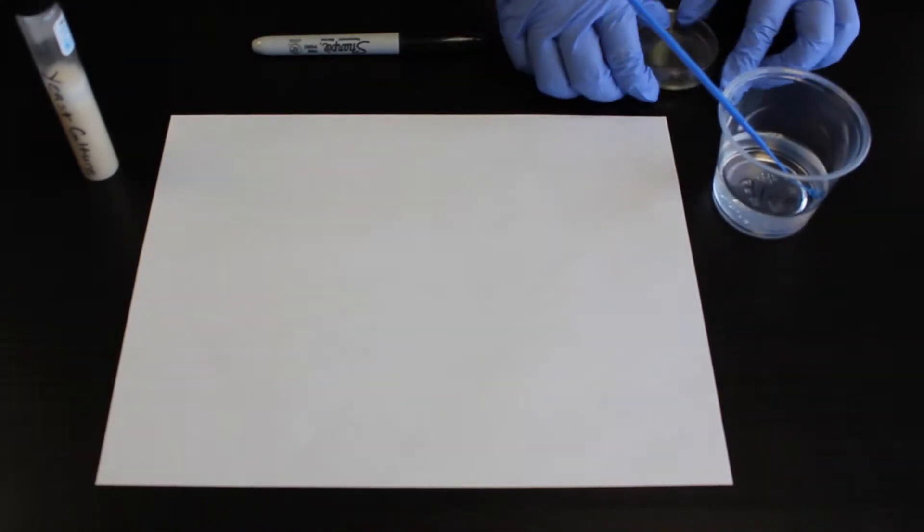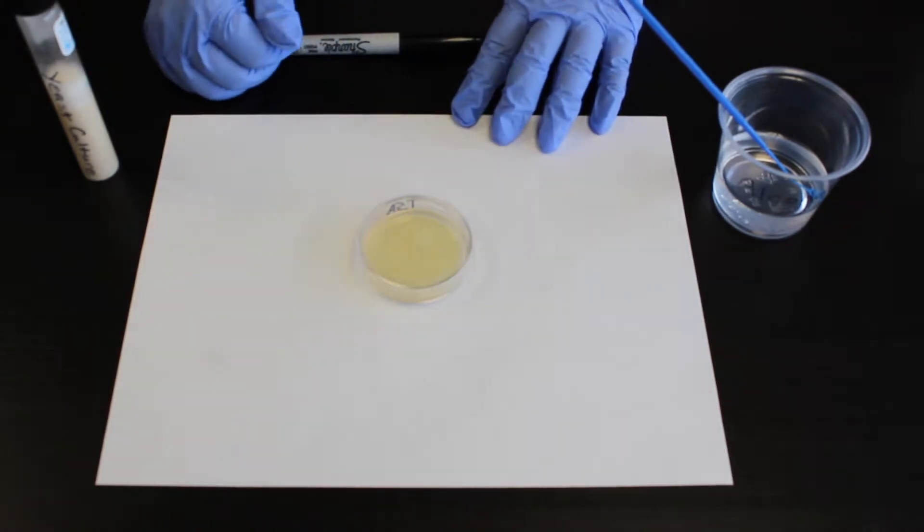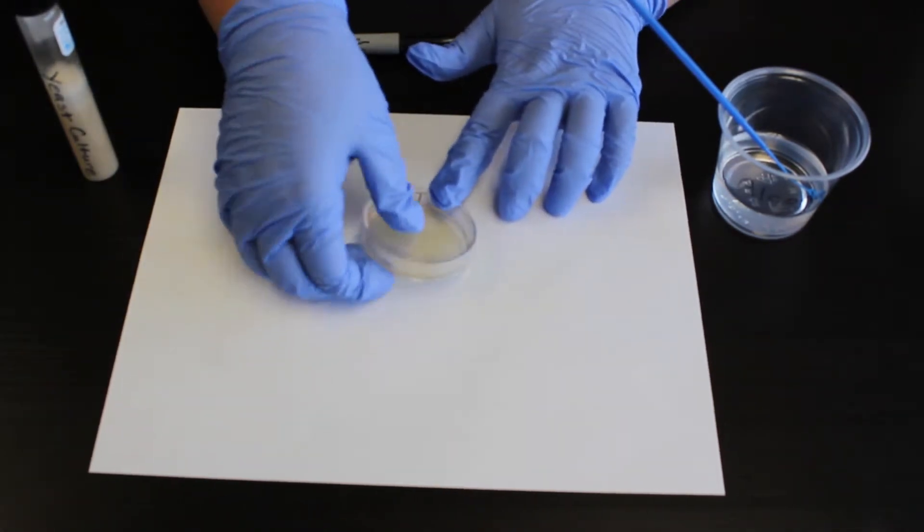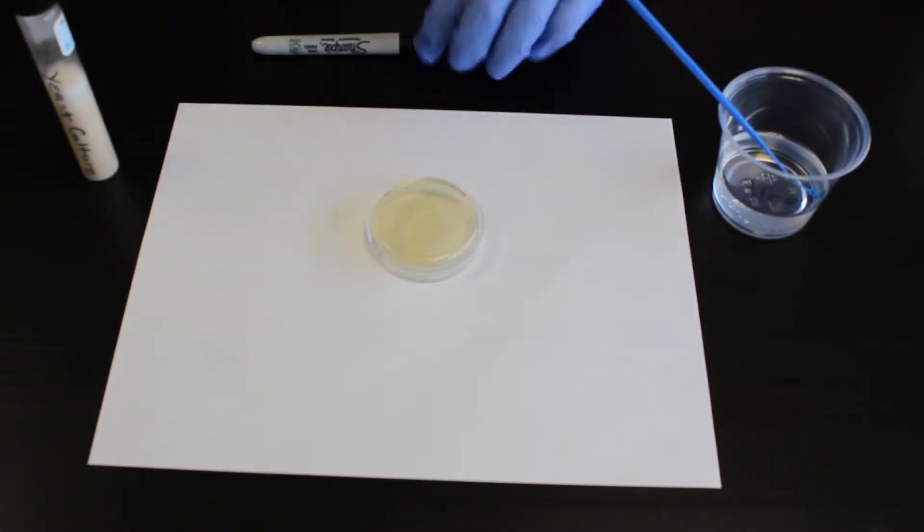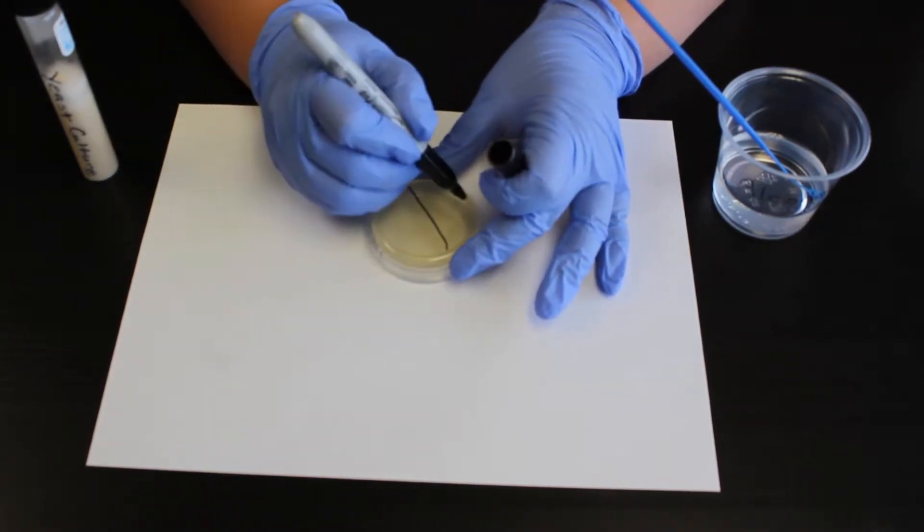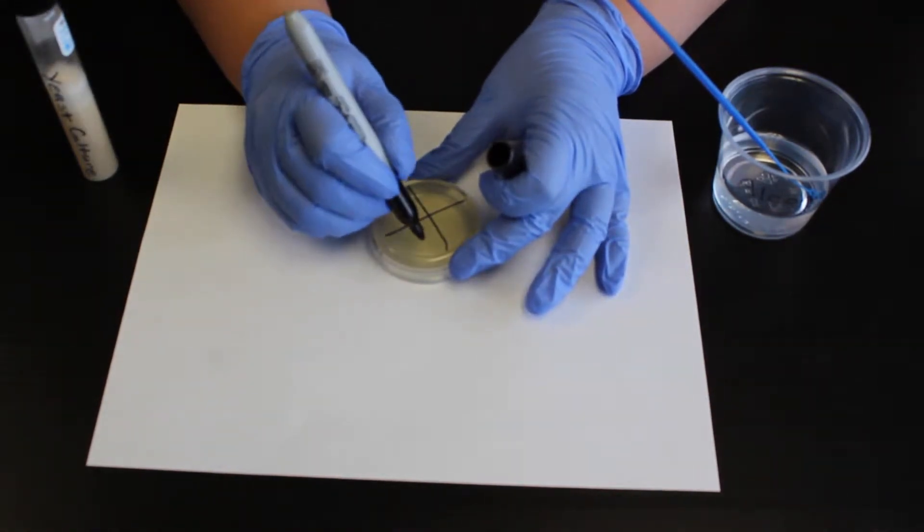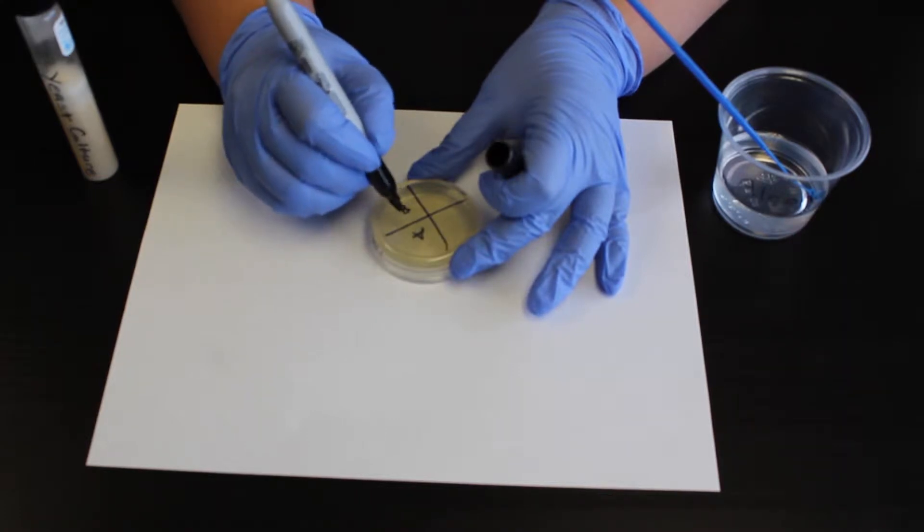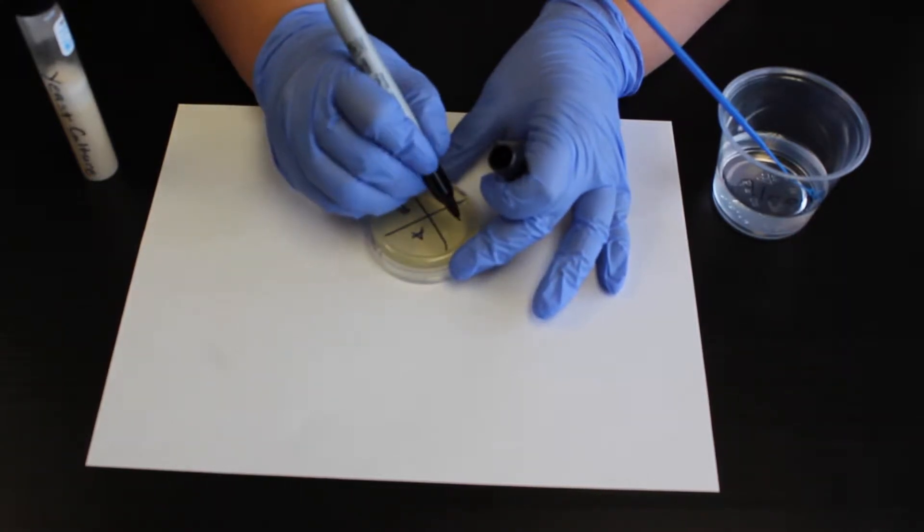Place a 60 millimeter TSA plate on the workspace. Without opening the plate, use a permanent marker to label bottom agar side into four equal sections in order to illustrate quadrants for streaking. Label the quadrants A, B, C and D.